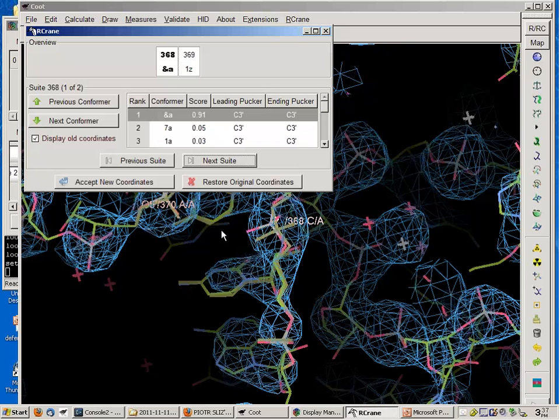Okay. And this Ramachandran plot you showed earlier on, is it something that is not available right now within Coot, right? No, so you can't do this within Coot. You can do this within Amigos 2. I'm almost positive that's also available through SBGrid. So that's a Java application where you can load in an existing crystal structure, and it'll generate a Ramachandran plot for you.